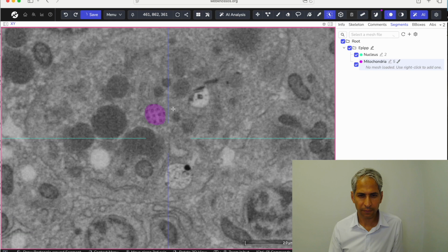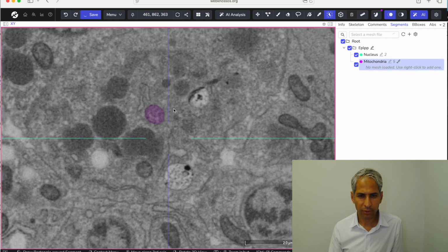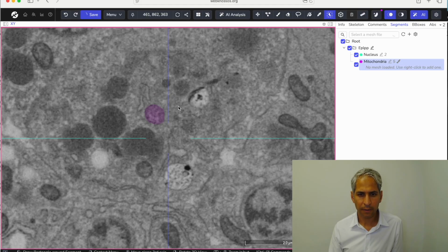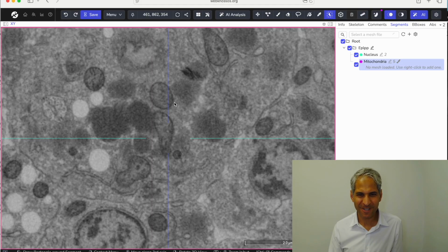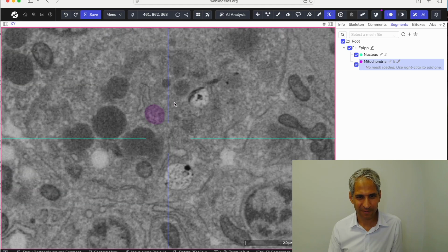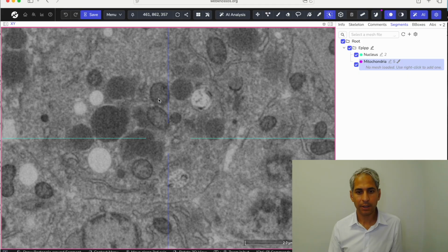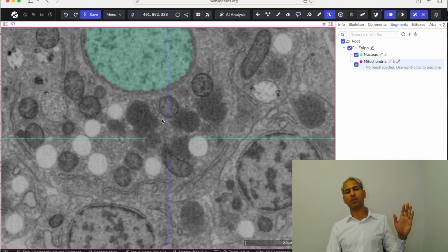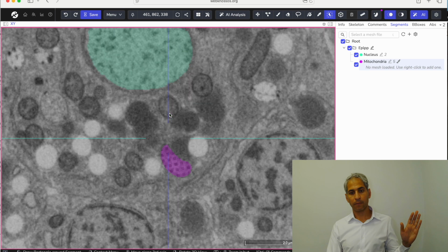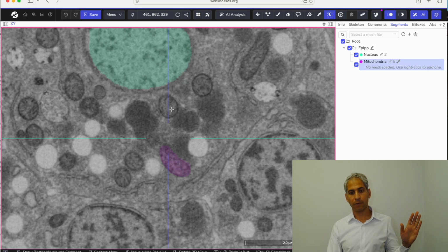I think we did a sufficient job, but I'm going to do myself a favor and get that one piece that's, don't run away. No, lost it. Okay, if it's taking more, if I don't do it this time, I'm going to let it go. Oh, look at this, I can do this. Okay, let's see what we got so far. Oh, this is part of it. This is part of it.